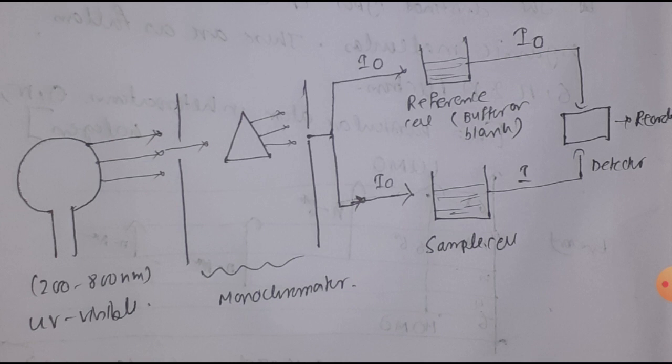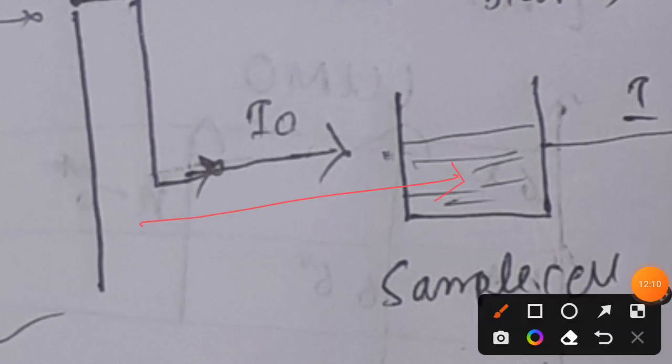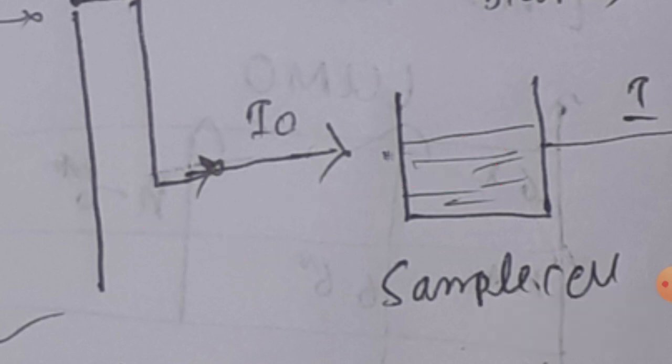That is the case in the case of the sample here too. After absorbing the incident light, the samples become excited, and as a result one of the electrons present in its valence shell, the valence electron, undergoes a transition from its low energy state to a high energy or excited state. This kind of transition is known as electronic transition, and make it very clear that it is only the phenomenon for UV visible spectroscopy.